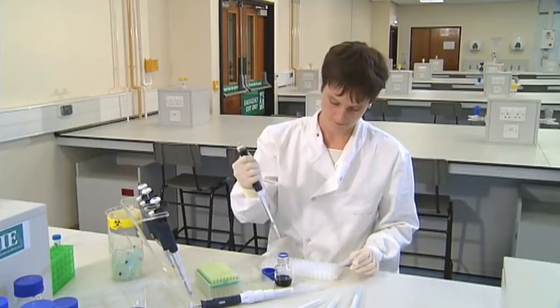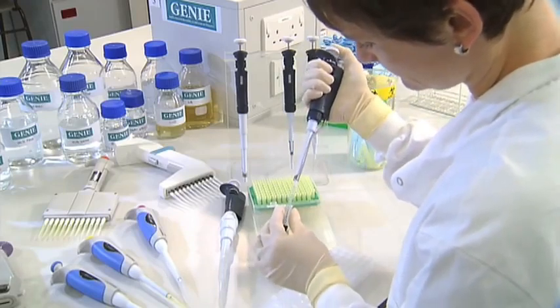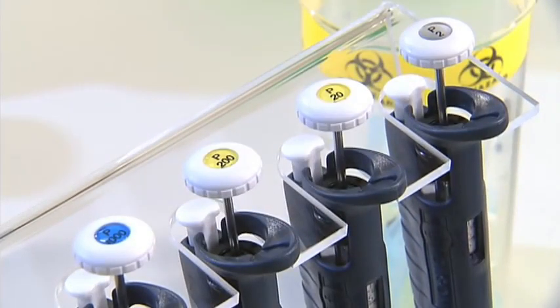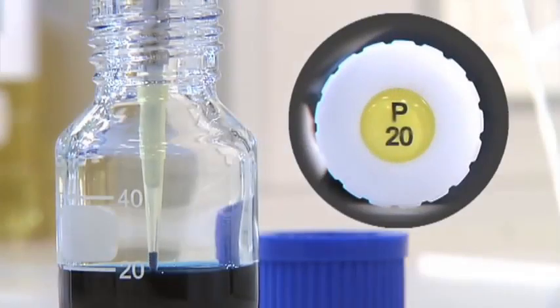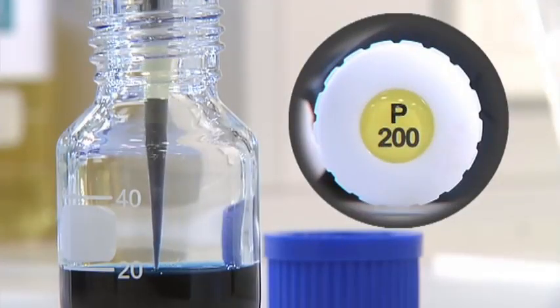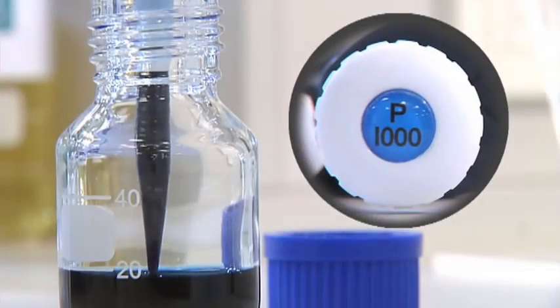Different pipettes work across different ranges of volumes and are named by the maximum volume they pipette. The different pipettes look very similar, so they're labelled on the top of each push button with a capital P, followed by a number which indicates the maximum volume for that particular pipette. A P2 pipettes between 0.2 and 2 microliters. A P20 pipettes between 2 and 20 microliters. A P200 pipettes between 20 and 200 microliters. And a P1000 pipettes between 100 and 1000 microliters.